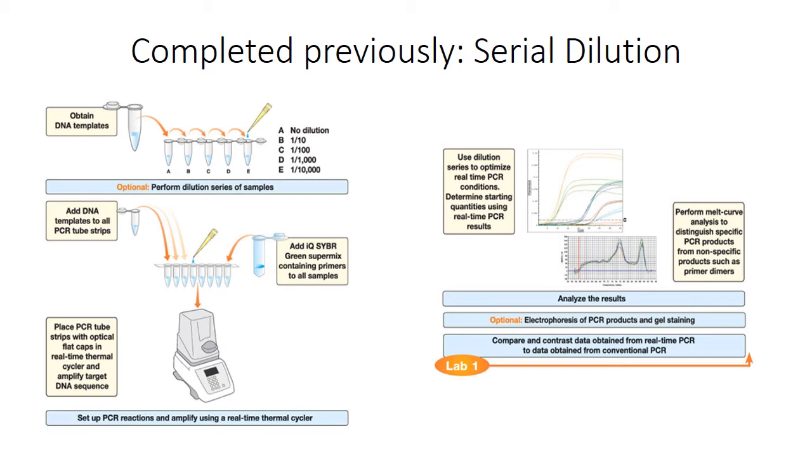This allows the thermocycler and the fluorescent signal, in essence, to get used to the amplification curve of that particular primer. So you can set up your dilutions and make your melt curve analysis. As we're analyzing our results, it will also allow us to learn more about our particular primer by coming up with a log behavior.